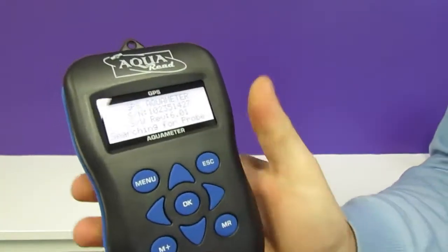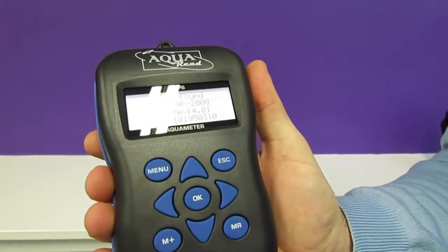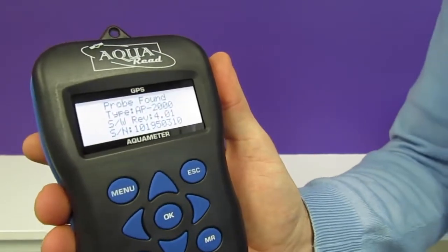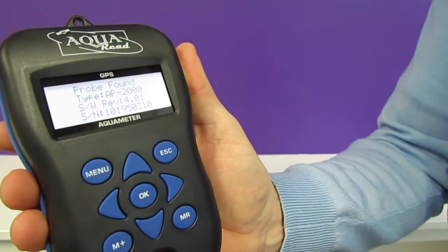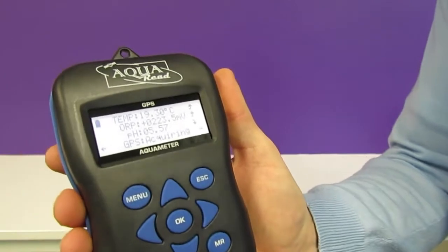We can now turn the meter on. The meter will check for the probe and we're ready to start taking readings straight away.